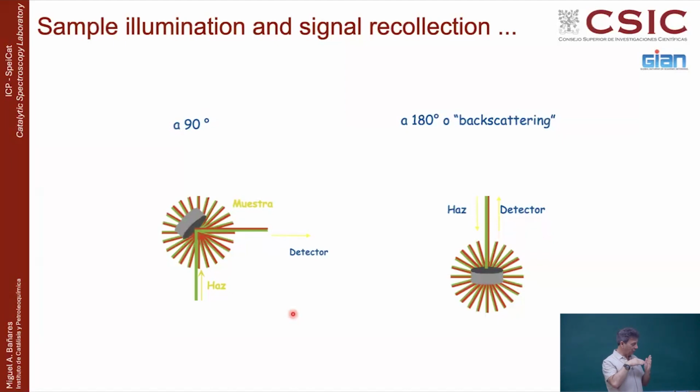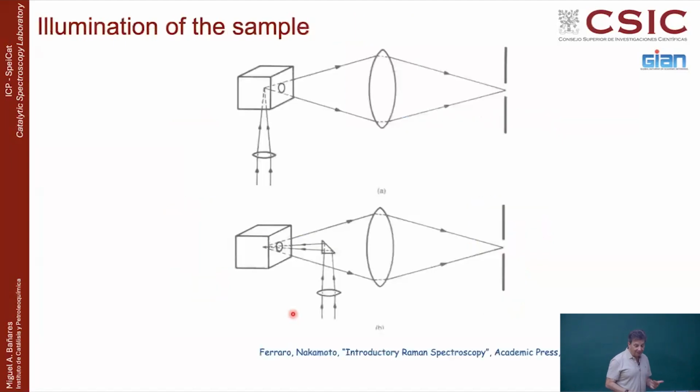Now all you have to do is like photography, focus. When it is in the focal plane, that's it. You don't have to orientate, you don't have to tilt, no. Everything is aligned. It's the same direction you illuminate, things go back. And that makes things extremely simple.